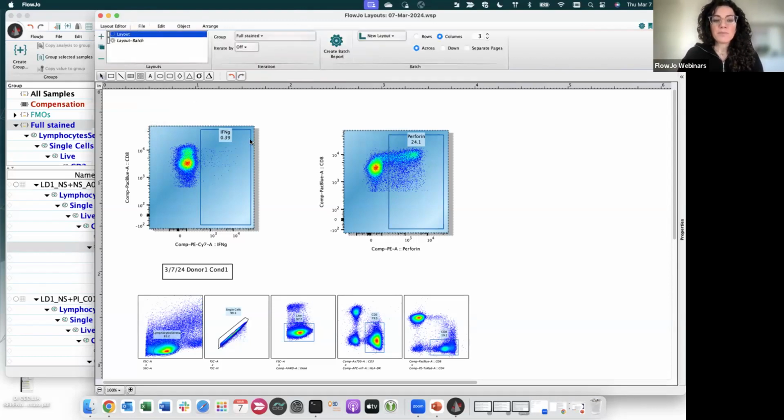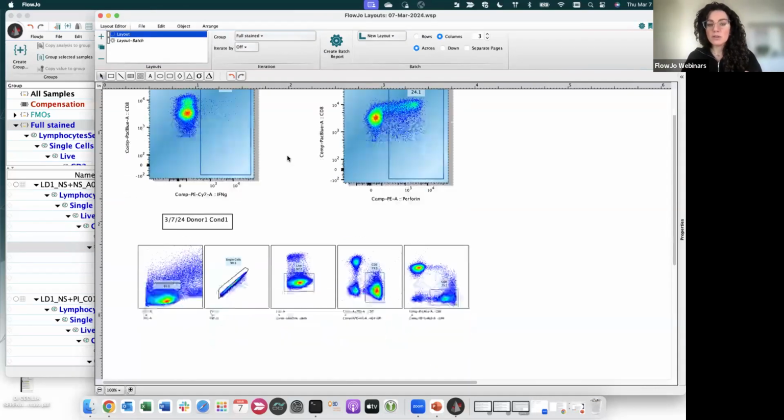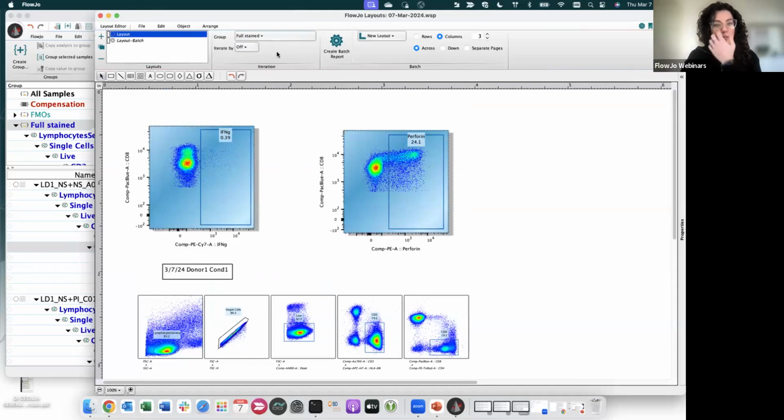Now, we have seen individual markers in individual conditions. Well, 2 markers in one condition. If we go on to the next one, we will see the next sample, 2 markers in one condition and so on. Going back to the question that I got, can you make a histogram overlay and assign different colors for each condition?